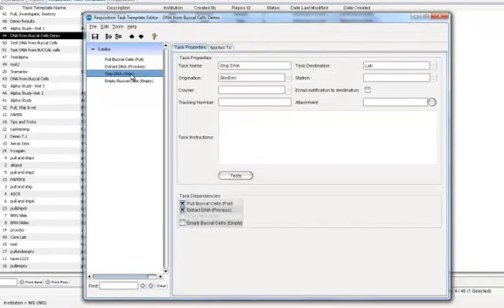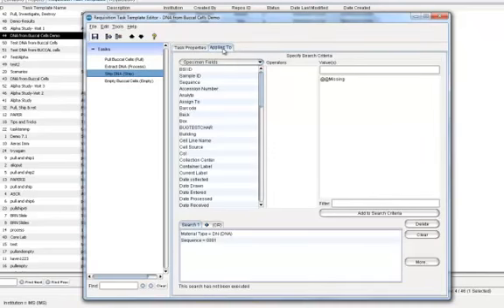For the ship task, I have set some default ship task properties, including the task destination, and have made the task's completion dependent on the pull and process tasks. Since I only want one DNA specimen shipped, I have specified the task be applied to the DNA specimen with the sequence of 0001.